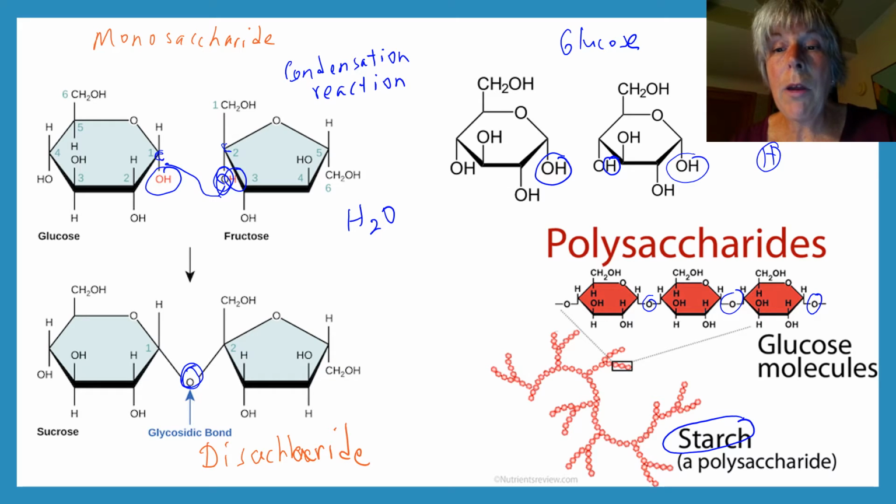In the banana lab, we will look at the amount of starch in bananas, and starch is an insoluble substance. It doesn't dissolve in water. Those OHs that are very polar in the glucose and the fructose and the sucrose, which make sucrose and fructose and galactose all soluble, are gone in the polysaccharide because everything is joined together and you've got this long chain molecule that's basically nonpolar.